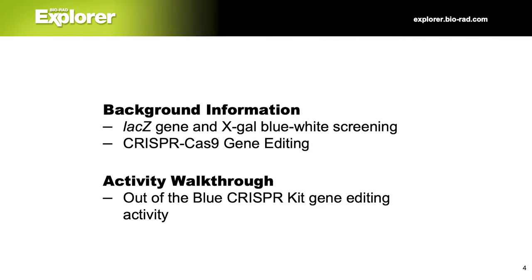Let's start off with some background information on lacZ and blue-white screening. Then we'll make sure you're up to speed on CRISPR-Cas9 gene editing and discuss how it's used in this lab. Finally, I'll walk you through the out-of-the-blue CRISPR gene editing lab activity.